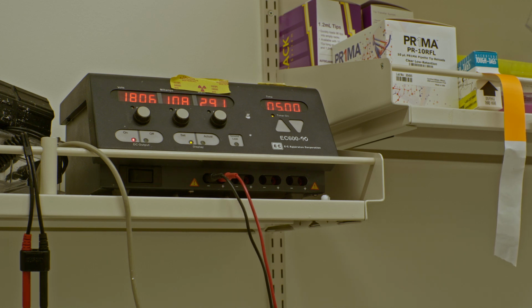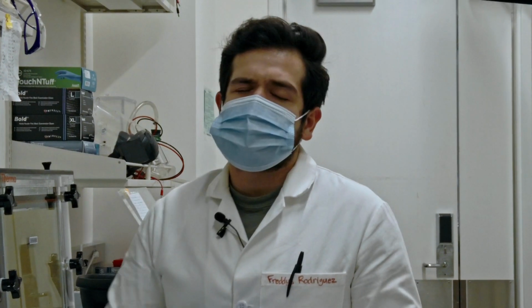You could try to run it at 2000 volts, but at 2000 volts, the gel might be getting a little too hot. Depending on what kind of experiments you're running, it might get so hot that your DNA can begin to degrade, your RNA, which is a little bit more scary, or you might heat the glass plates too much, so that they are so hot to the touch that they will crack, which is the worst case scenario. So I recommend, from personal experience, 1600 to 1800 volts max is what you should be running this gel box at.